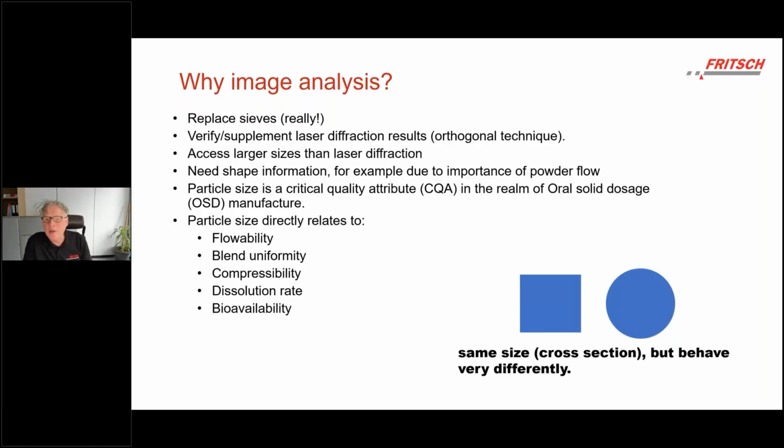And so you need to determine and measure the particle shape as well as the size distribution, of course.